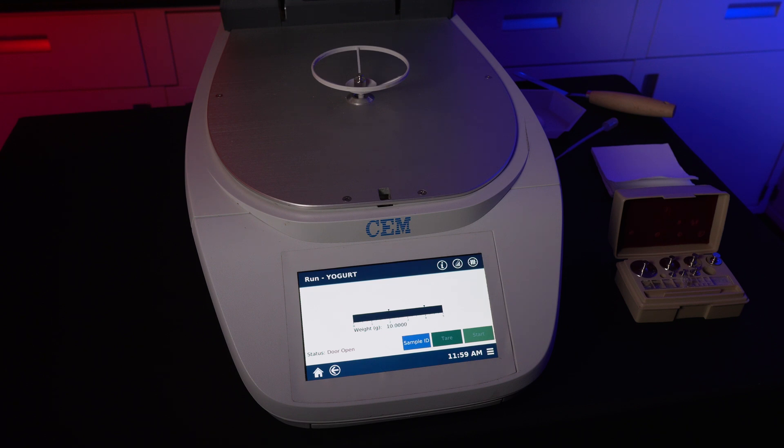If the indicated weight is still wrong, there might be an issue with your instrument's balance. Contact us at info@lissci.com and we'll get back to you as soon as possible. If the displayed weight is correct, remove the weight and the calibration is complete.